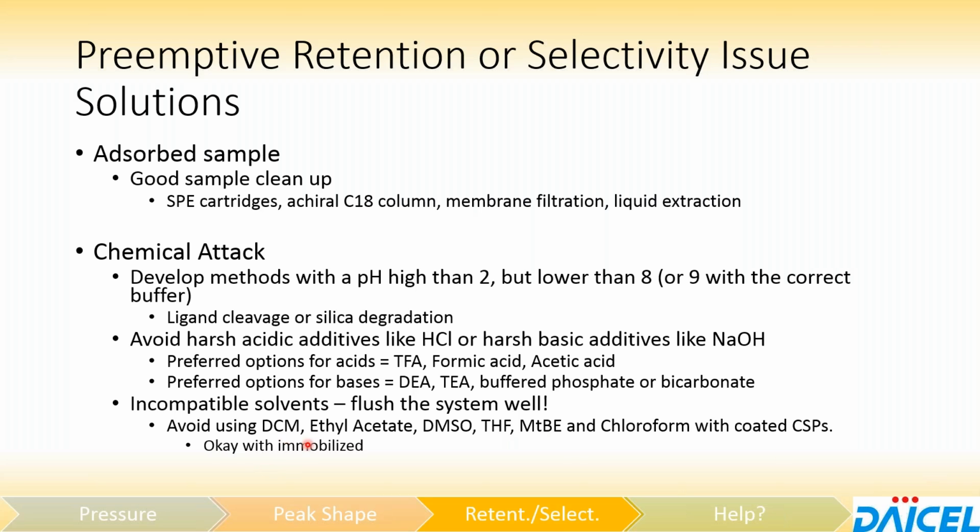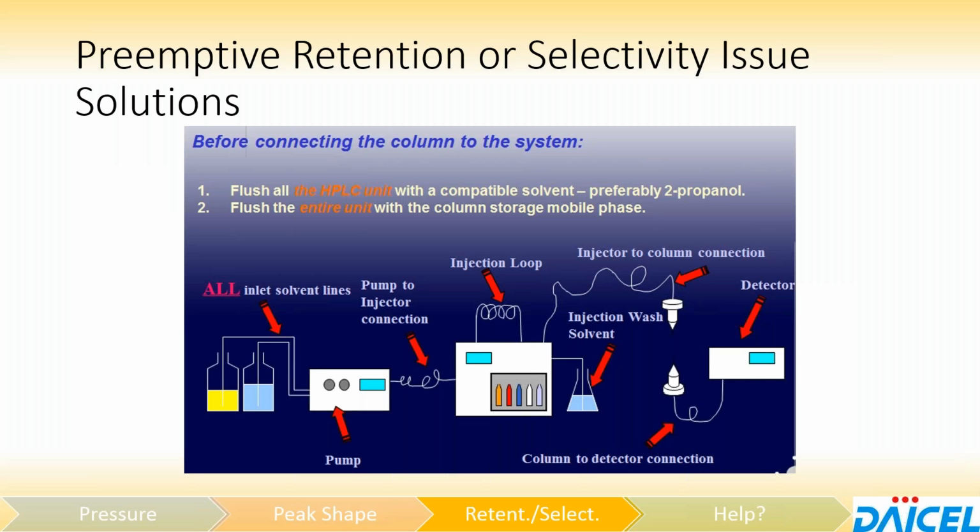They are okay with the immobilized columns, but make sure absolutely that if you're going to use the same system that has these extended range solvents on them and you're going to use a coated phase at some point, that you flush very, very well.